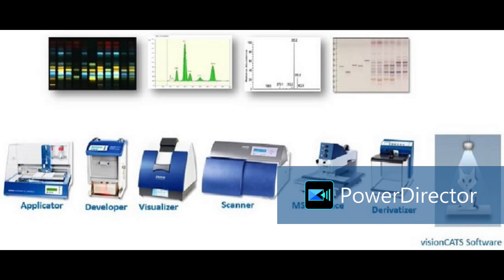So suppose your derivatizing reagent is inside and your plate is also inside, and you have to spray. This is because we have started MSc, these are all MSc students, so there is no way that we can shift to a permanent derivatizing reagent right now. We may add some more courses next year, probably integrated BSc MSc. After this there is heating.